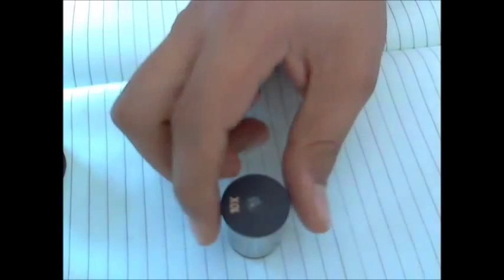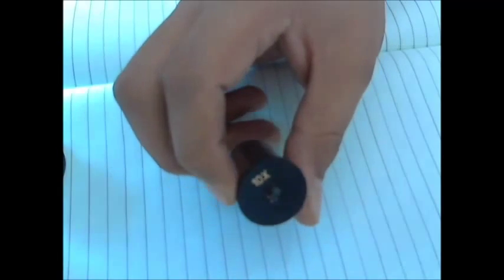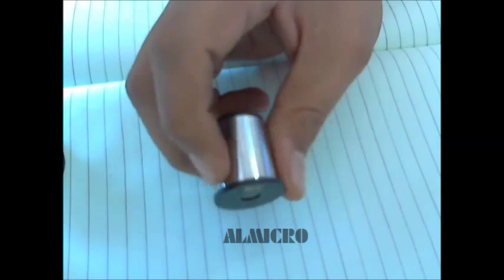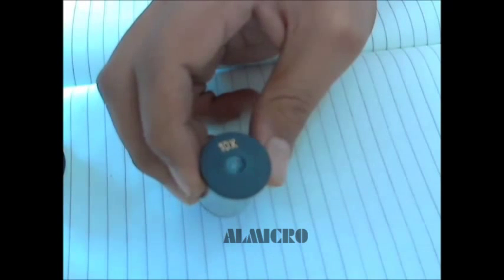Hello everybody. Today I am gonna teach you how to clean your eyepiece. This is a Hygienian 10X eyepiece that we normally use in a student microscope. Normally it gets fungals on the lenses and it is very cumbersome for us to clean it up, and we have to call the repair person and everything.